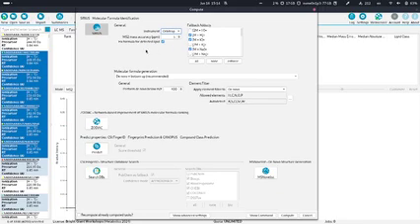Then the other option you have here is this fixed formula for detected lipid. In SIRIUS, there's also lipid detection, like an extra tool which does not have any settings here, except for this one. But it will also be automatically run, and it might detect that the feature you're trying to annotate is a lipid, and it will even output the lipid class.